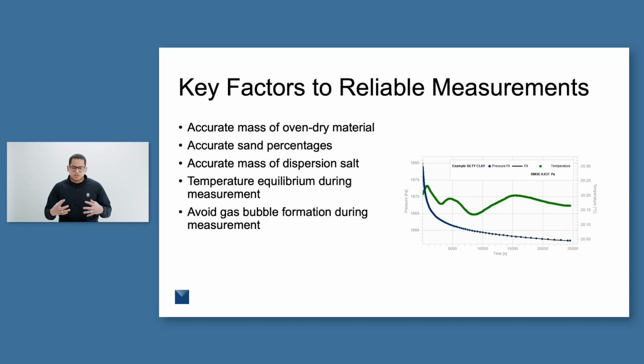So these are some tips that I have for making really good particle size analysis measurements. There are, of course, other things that you can think about, and there are some other critical factors for some of the optical methods, like particle size orientation. But these are my tips for making good particle size analysis measurements.